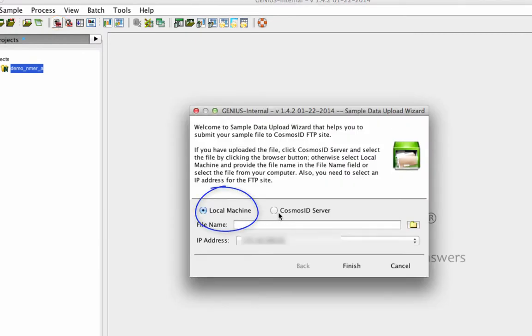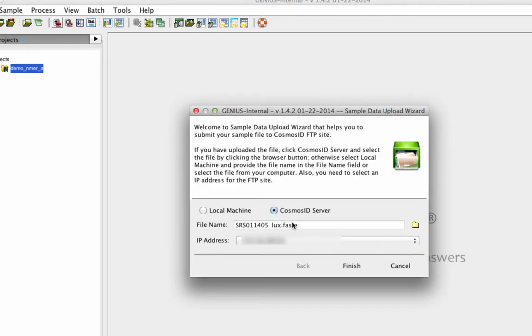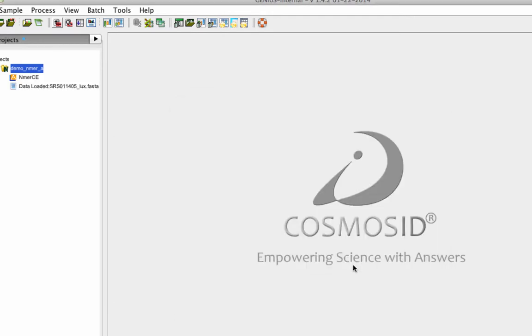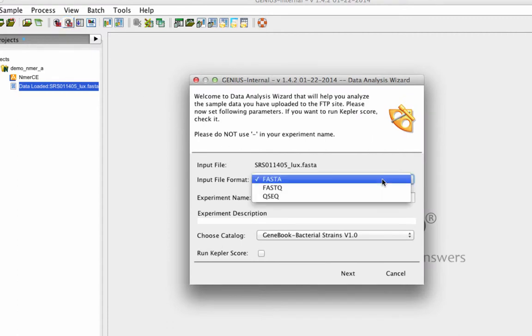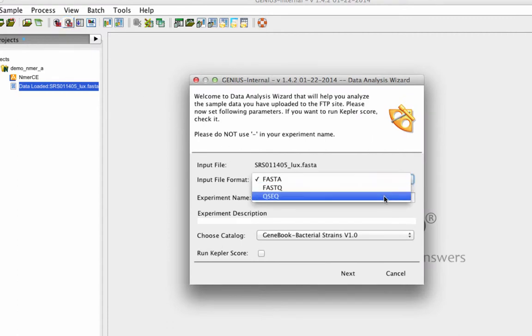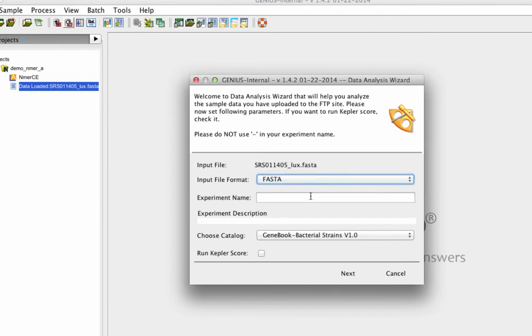You can load sequence data from your computer or you can FTP transfer your data to the Cosmos ID server. Your data can be in FASTA, FASTQ, or QSeq format.